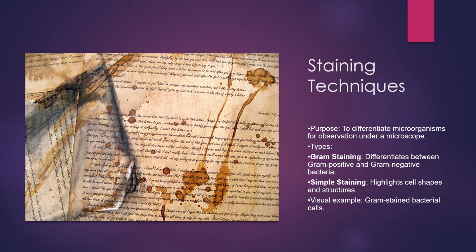There are many techniques that are used to identify bacteria. And so the gram stain is one of the most powerful techniques that can be used and essentially identifies or categorizes bacteria that can retain the stain and which cannot.